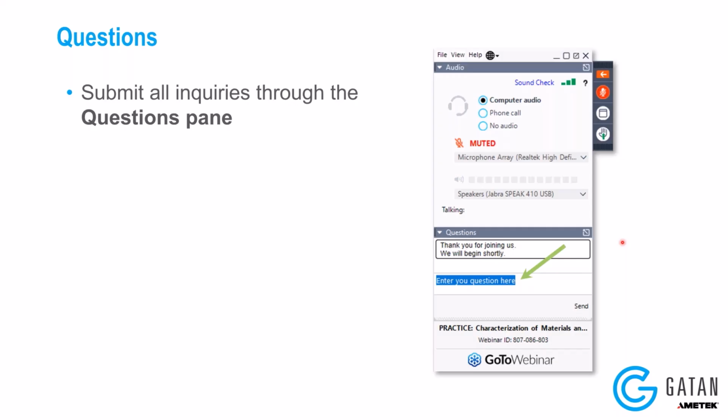DigitalMicrograph with STEMx OIM also comes with a library of many, but not all, crystal structures and samples. That's a subset of the structure library that comes from the EDAX EBSD software. So there are a lot of different places where you can get the structures that you need for the analysis.